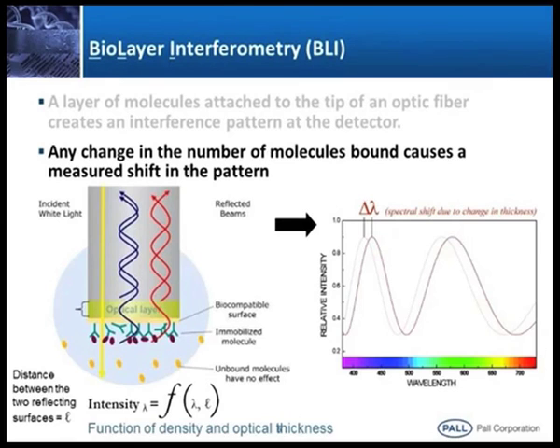So if you look at this diagram, the antibody starts binding to this ligand. Earlier there is a constant reflection from the internal optical layer. Now there is a reflection coming from here. If you look at this, the path length increases. Earlier the light was coming from here, now the light is reflecting from here.